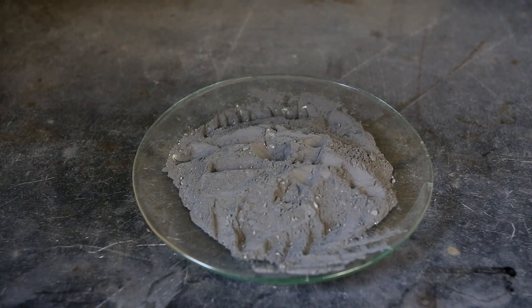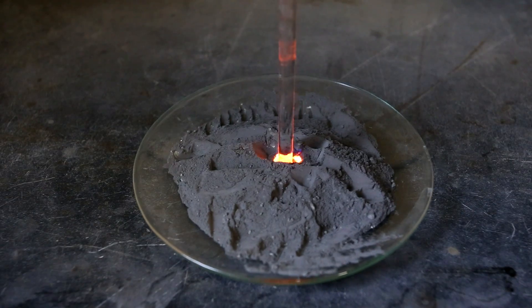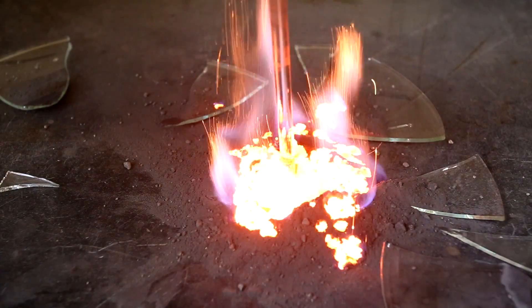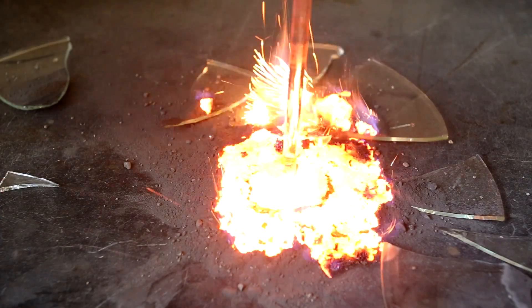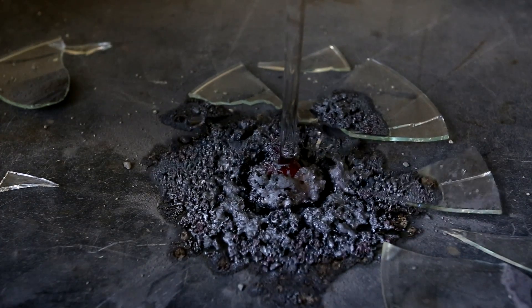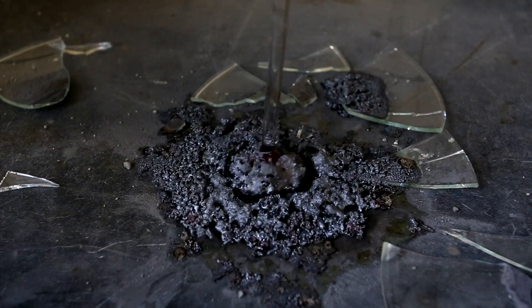This video also shows why you should not carry out the reaction on glass or porcelain. The reaction is extremely exothermic and it can easily crack and shatter glass. In the end, you are left with a very hard, dense material that is stuck to the end of the glass stirring rod.